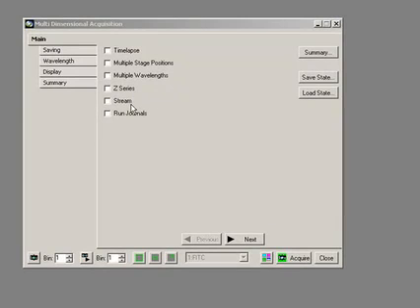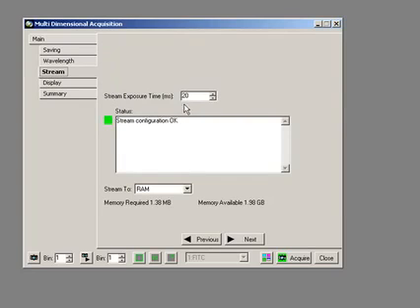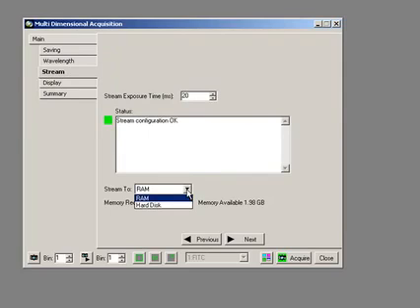If I click streaming, we'll see we've got a new stream tab. Let's go there quickly and see that we have an exposure time, which is our rate limiting step. We can see it's okay, and we can pick that we can stream.